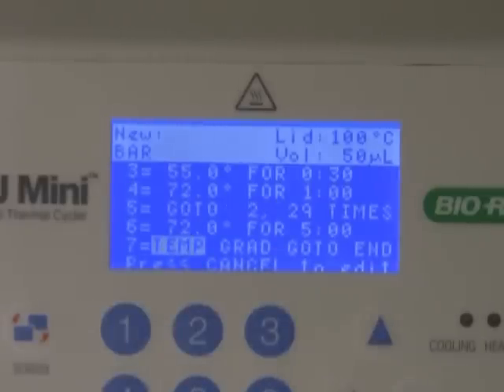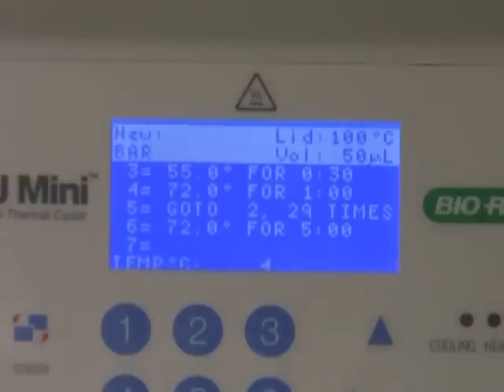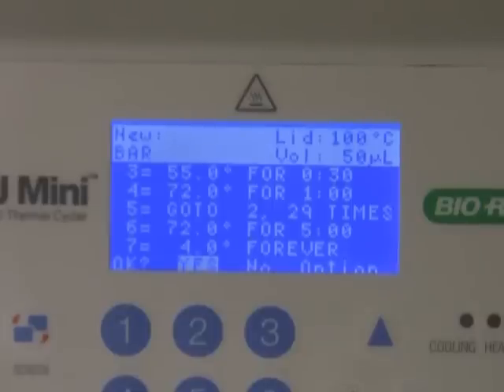Step 7 is 4 degrees forever. This step is necessary in case you want to start your PCR reaction in the evening and then come back in the morning. This way, the thermal cycler will keep your tube chilled overnight. And step 8 is the end.